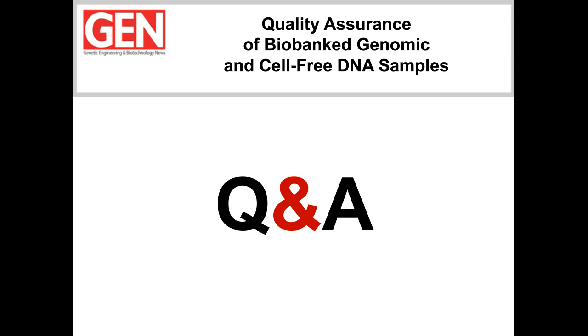All righty, thank you. And it looks like we have our last question here. How much sample volume is required for the TapeStation, and what is the sensitivity of the system? Yeah, in general, it depends on the application. We use either 1 microliter for the standard sensitivity application, and for the high sensitivity applications, it's 2 microliters of sample volume. Highest sensitivity is 5 picogram per microliter of DNA. Yeah, that's for single fragments.